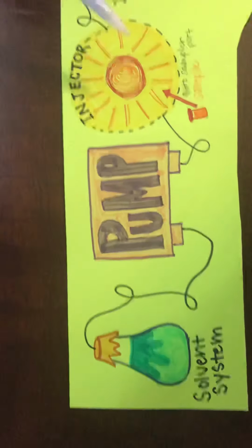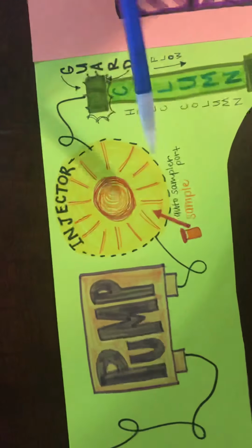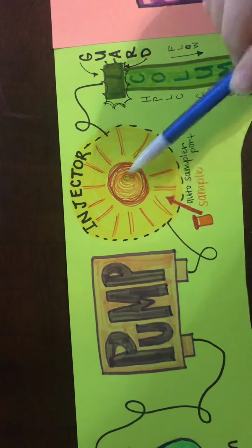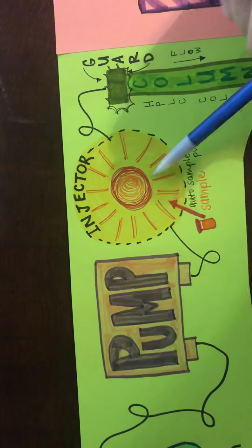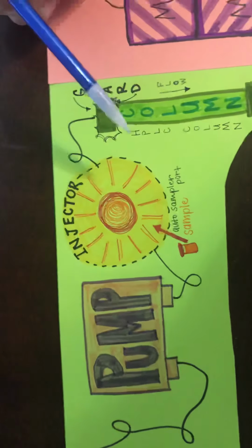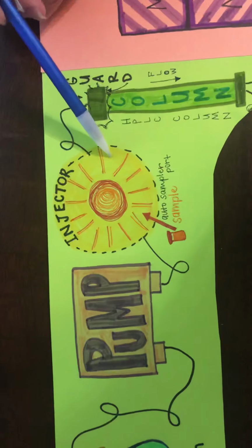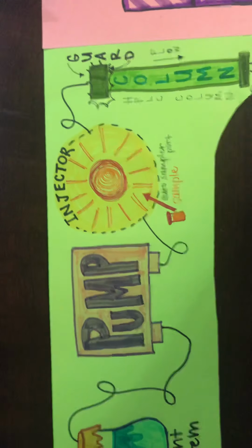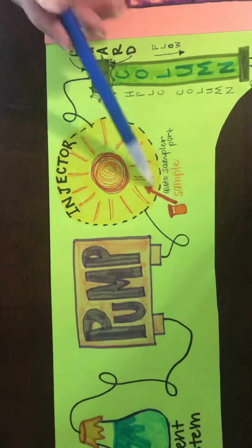So from our pump, we have our injector site, which has our auto sampler port with a little sampler. I know it's a sun. It was really rainy and I was wishing the sun was out, so I made the injector a sun. And at the injector, we have our auto sampler, similar to one that we have on our GC model, which is right down here. I just made a little arrow.